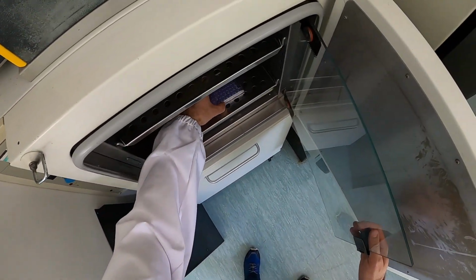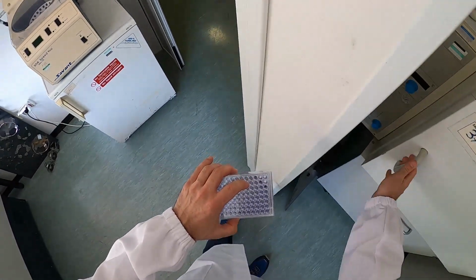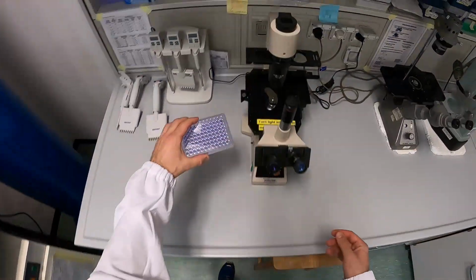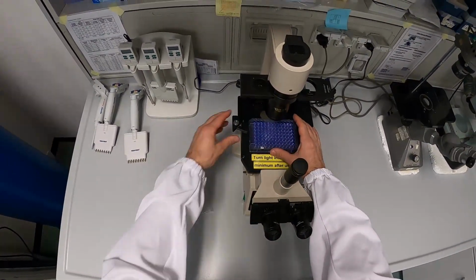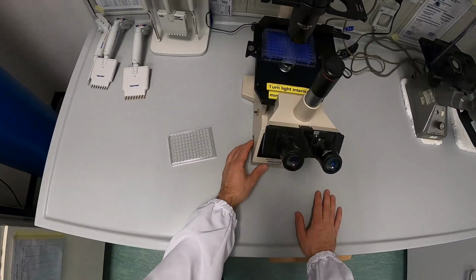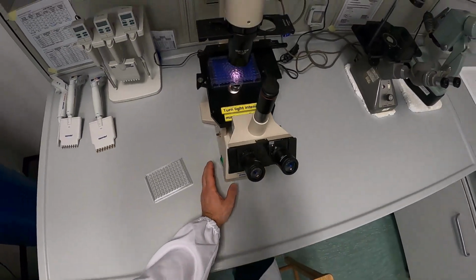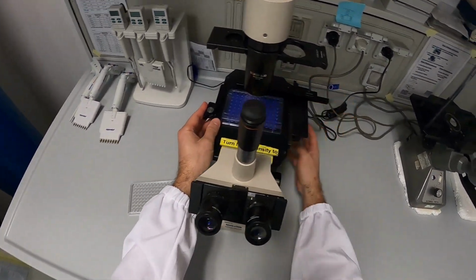So now is really the moment we're going to have a look at the result. I'm extremely curious. Let's go back to the tissue culture room. Okay, let's take the plate, take off the lid and place it on the microscope. And there we go. Make yourself comfortable and start looking at those wells. Maybe first with a low magnification, followed by a higher magnification. What do you see?